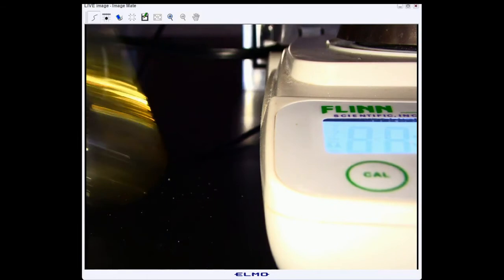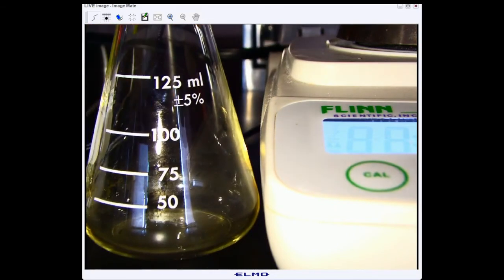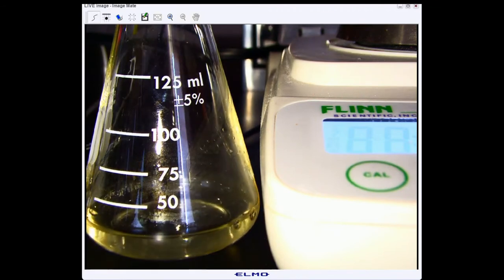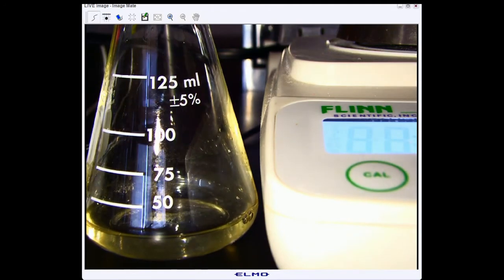I'm going to remove my flask from the scale and add my vinegar to the flask. I want to transfer all of that and now we're good to go.